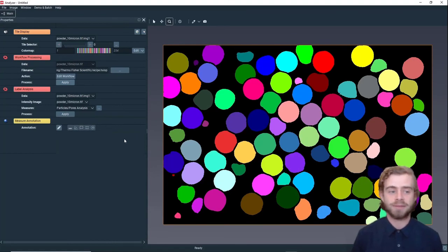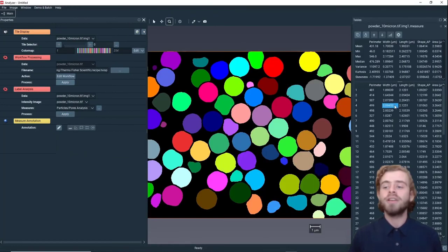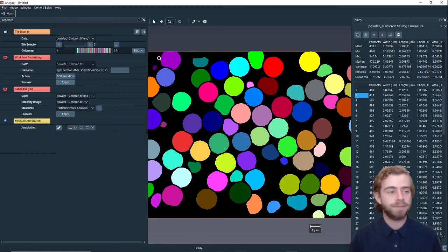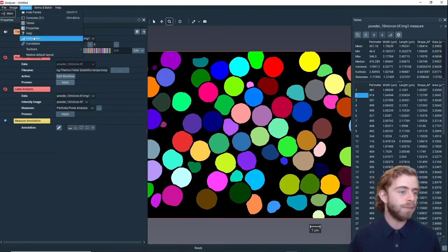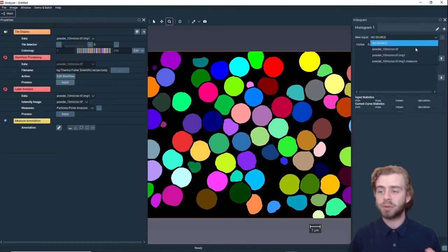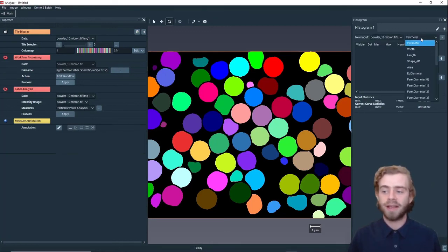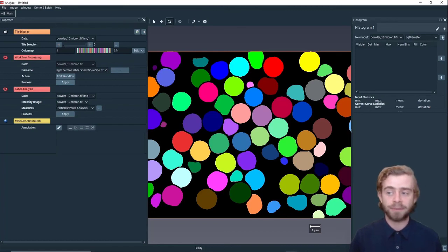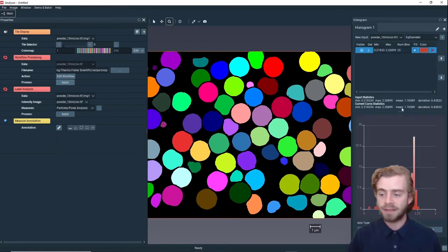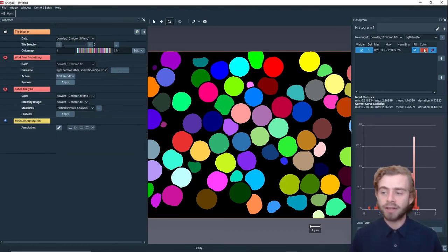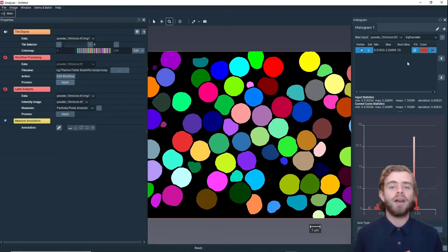Now that we have these individual labels, let's create a histogram of all the particles' equivalent diameters. To do that we're going to use the Label Analysis module, keep the measures the same, and click Apply. We've now calculated statistics for all the different particles in this image. To create the histogram we go to Window > Histogram, select the source as this 10 micron dot measure, select Equivalent Diameter as the input, and click Plus. It automatically created a histogram, and you can change the color, whether it's filled, and other options very easily.